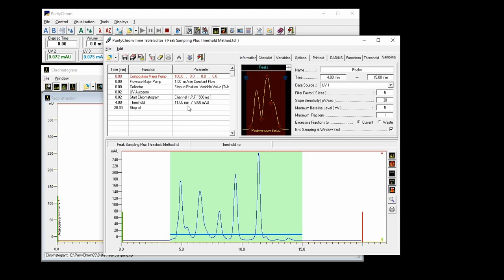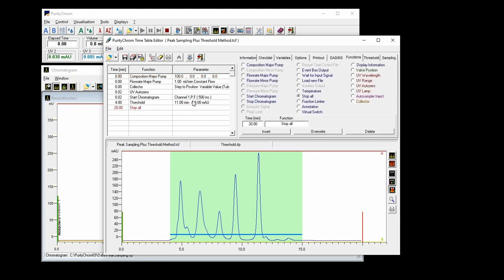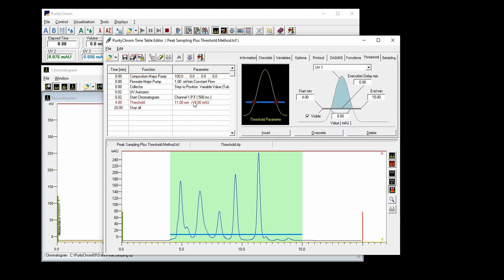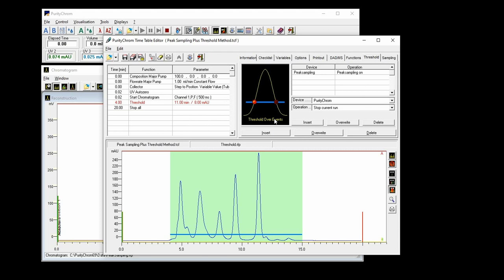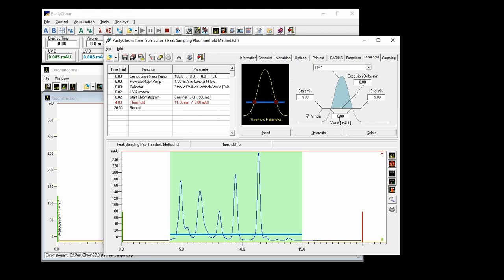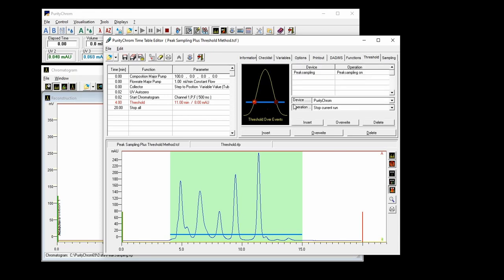What is also possible is to combine this peak sampling with this threshold upon which peak sampling will be triggered. This you can do by inserting a threshold and upon going over 8 mAU of this UV signal you will put the peak sampling to an on state and upon going below this threshold the peak sampling will be set off.